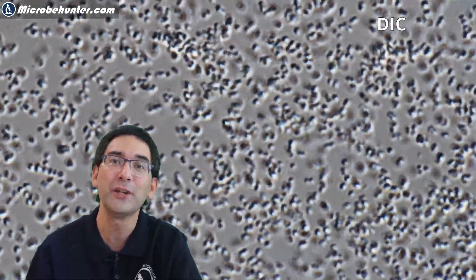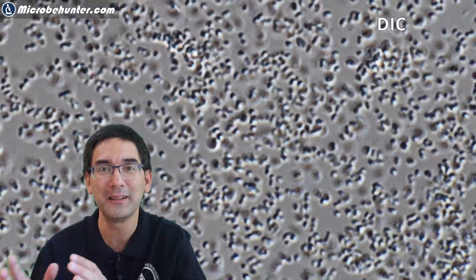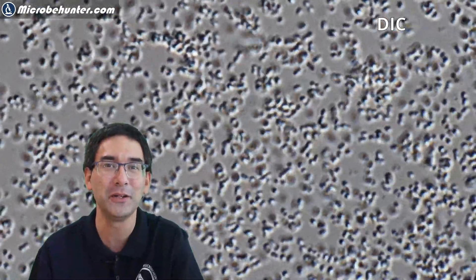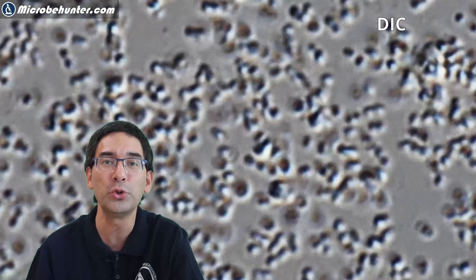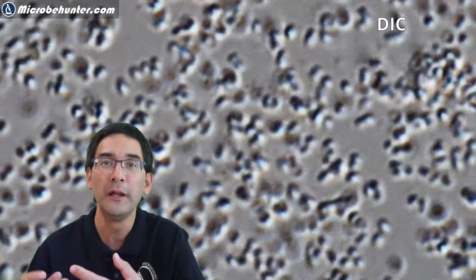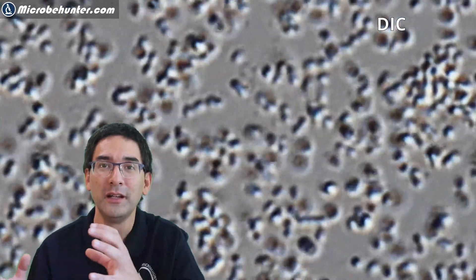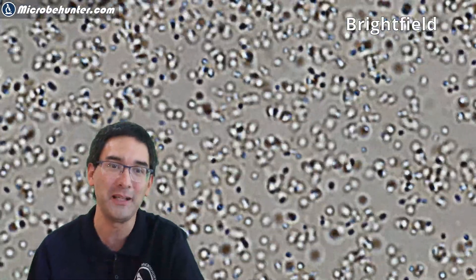This here is in differential interference contrast, or DIC. Here it looks a little bit like the light is coming from one side, so it looks a little bit three-dimensional, but you can also see the bacteria quite well. They're moving around. I think that in many cases they're moving because of so-called Brownian motion — they're not moving on their own, but because of thermal activity and molecules bumping into the bacteria, which causes them to shake. This does not mean they're moving on their own, but some of them actually might.